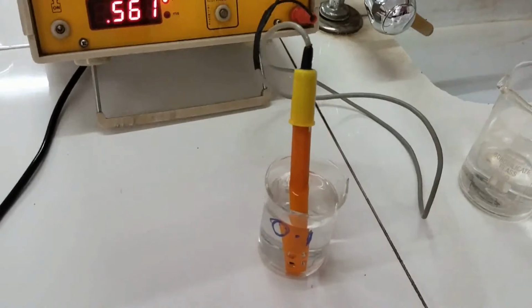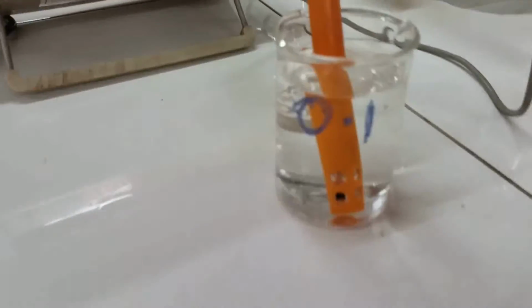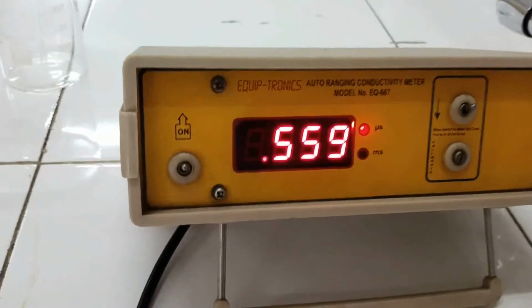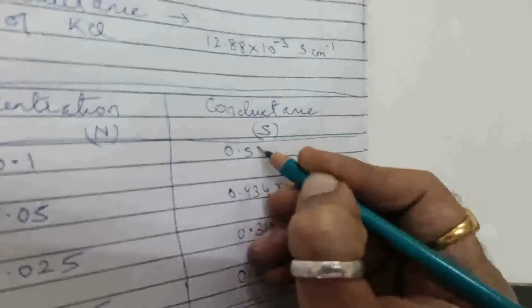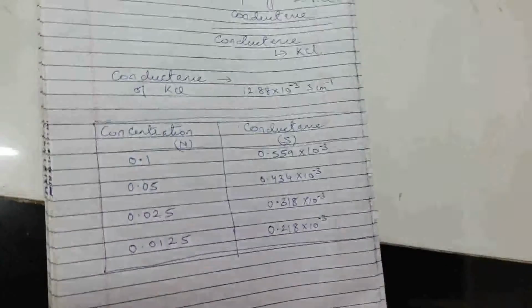So finally now we go into 0.1. What is this 0.1? Actually, whatever the acetic acid that has been given to us. That solution we are going to take, and we are going to note down the reading, and this is 0.559. So I write down over here 0.559 into 10 raised to minus 3.